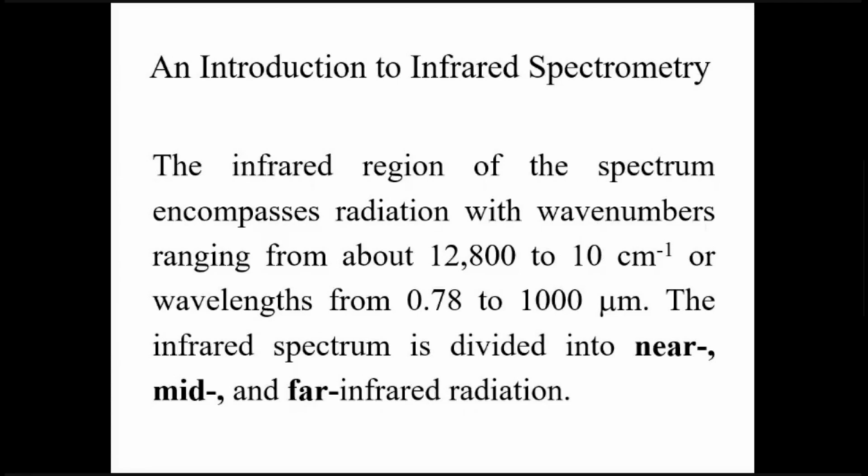The infrared region and the analysis of compounds when they are bombarded with electromagnetic radiation of these wavelengths which fall in the infrared region. They bring about some changes in the compounds. Those changes in the compounds also affect the radiations falling on them. The compounds absorb the infrared radiation which is suitable for that compound.